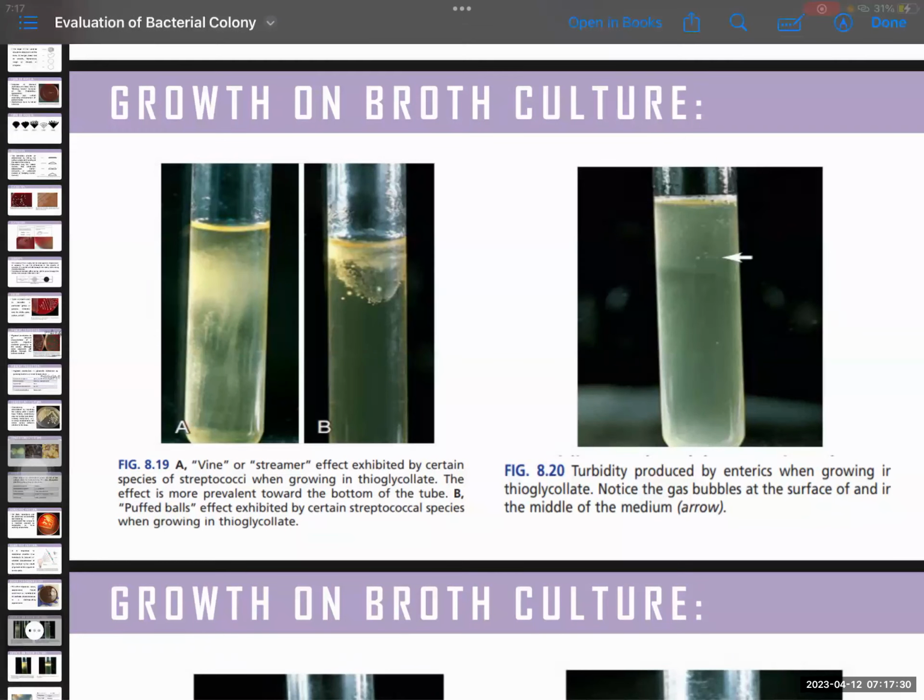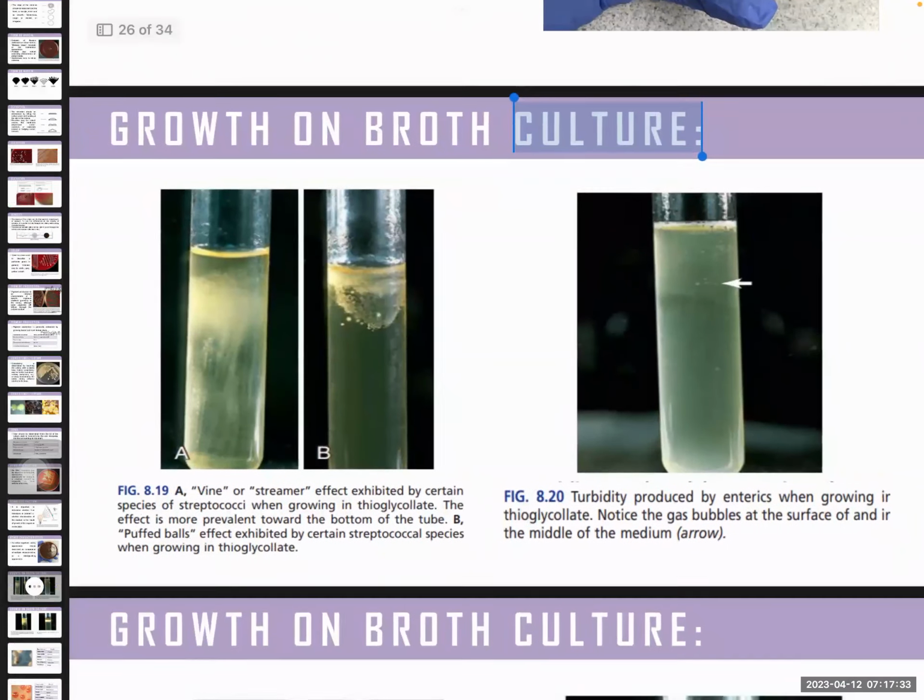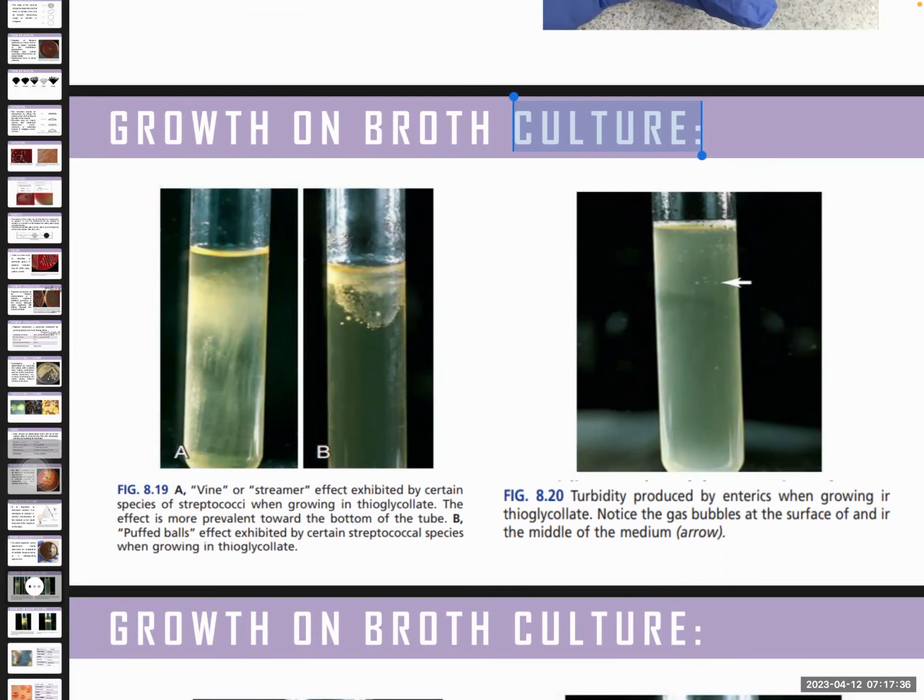Same lang din nun pala, class. Kapag contaminated yung plate, tapos may mga fuzzy part, huwag mo na open yan. Diretso, i-decontaminate mo na siya agad. Okay? Put some either bleach or acid. So I recently learned in Norway, they use very strong acid to decontaminate their cultures. So yun, just a warning, no, kapag may mga ganong instances, sobrang fluffy na, huwag mo na siyang i-open kasi all spores are easily disseminated.